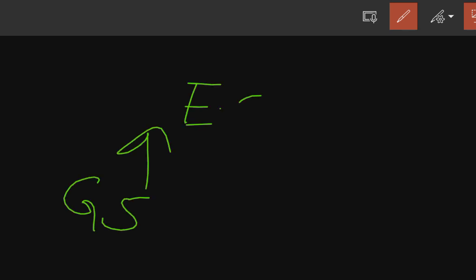After the molecule moves from the ground state to the excited state, if it wants to come back to the ground state, three things should be there: there should be no chemical reaction, no dissociation or rearrangement, or energy transfer by collision. Because of these possibilities, the molecule returns to the ground state and the excess energy is lost as heat.